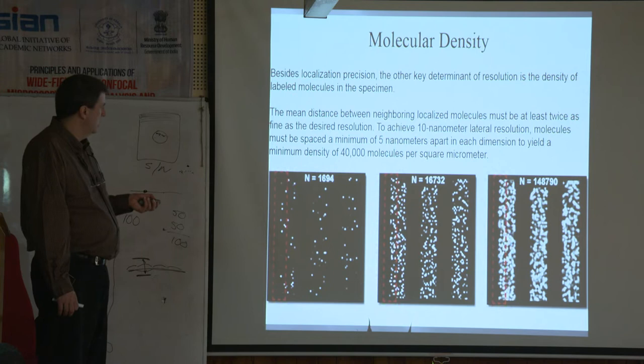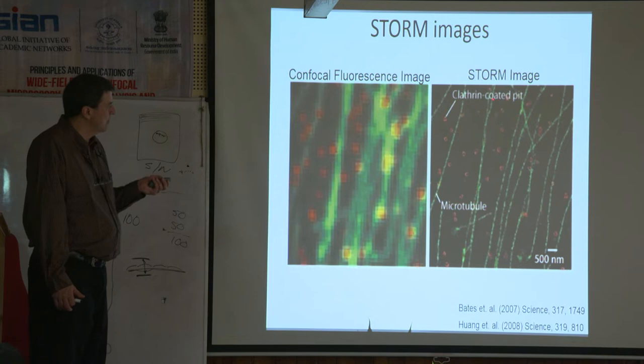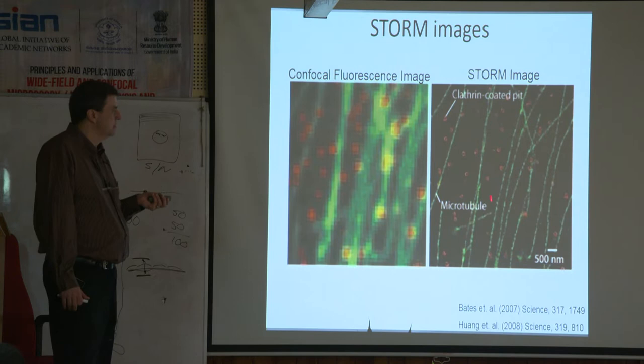A confocal is a fabulous and great image, but when we blow it up, it can really be resolved further, because you can increase the resolving power to get something like this. So things that were hidden from us in research, that we couldn't see because this was the best tool available, now have much better resolving power.